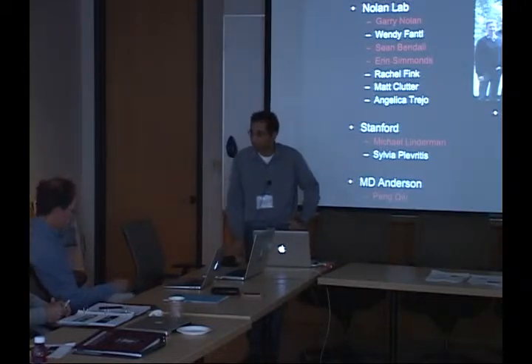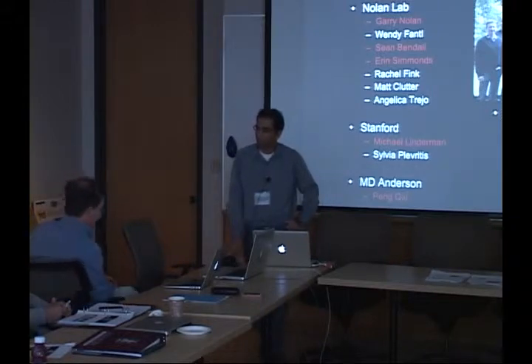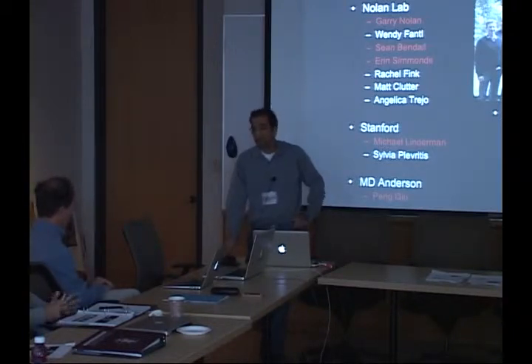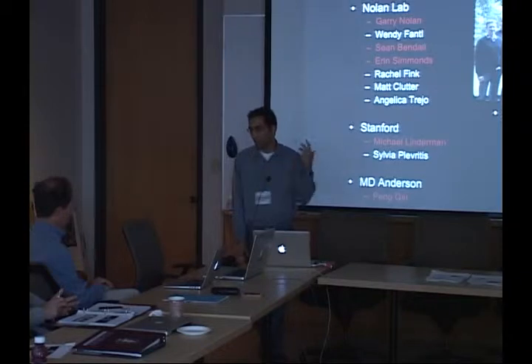I have a potentially naive question. With fluorescence-based cytometry, what are the limitations with respect to the breadth of cell types you can look at? Is that one of the limitations, or can you only do one cell type and look at different phases? I mean, there's a little bit, in some of the markers there are some subtle changes developmentally, so you sometimes have to do slightly different gates for different immunophenotypes, but there's really no limitation.